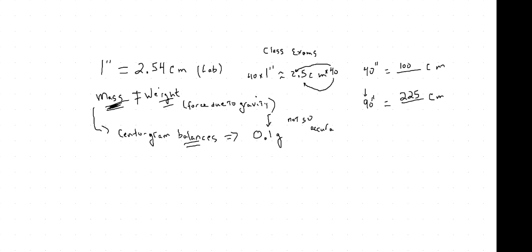Now, I just want to point out, suppose this is 0.7, and this is 0.8. If our marker, when we measure the mass of something, comes to this point, and let's say it was 23 point, now it's going to be 0.7, because it's a little past the 0.7. And now we can guess at the next decimal place. You see, we don't really know. So it looks like it's a little less than halfway. If it was halfway, it would be 0.75. So maybe I'll just say 0.74. So this last 100th place is not so accurate, but this is definitely accurate. So the centigram can measure, or estimate, up to the 100th place.